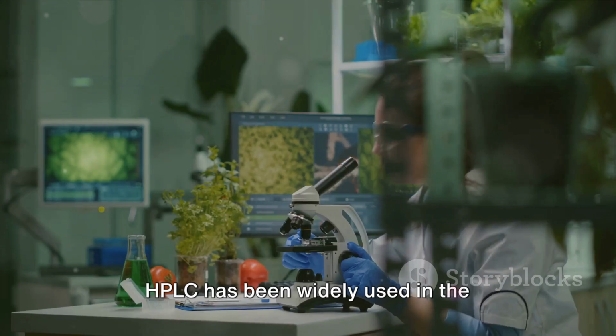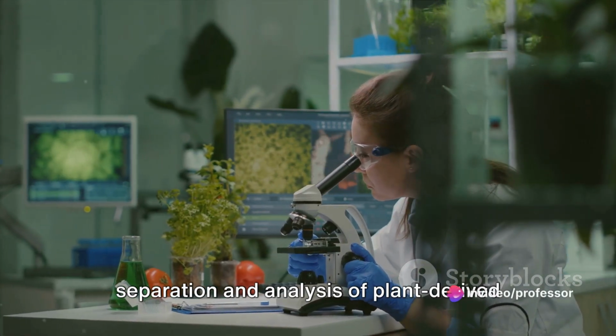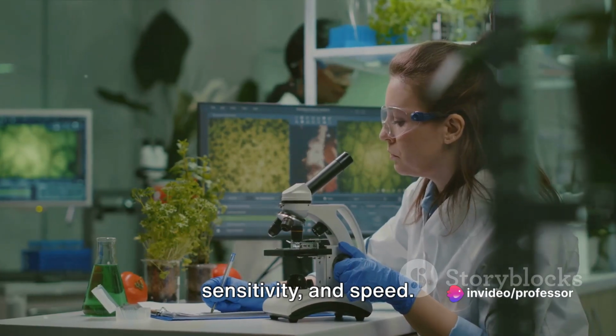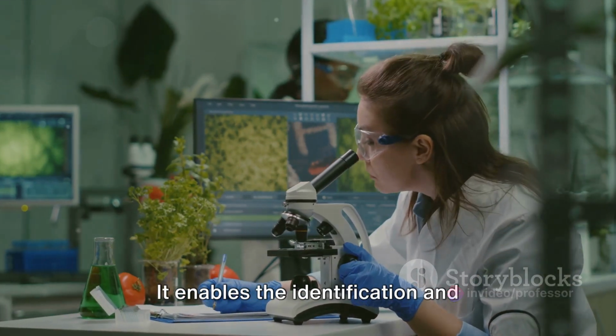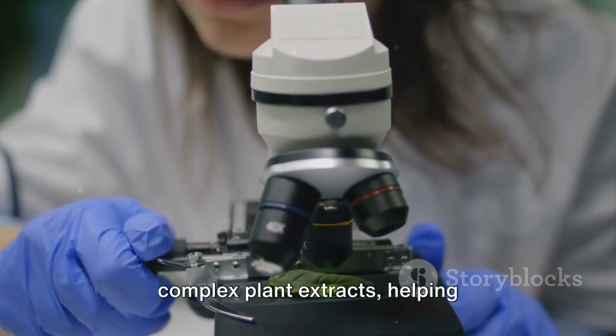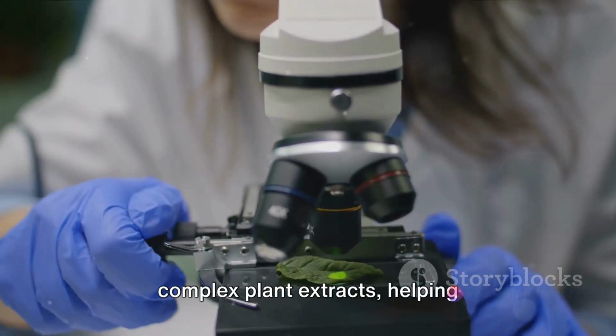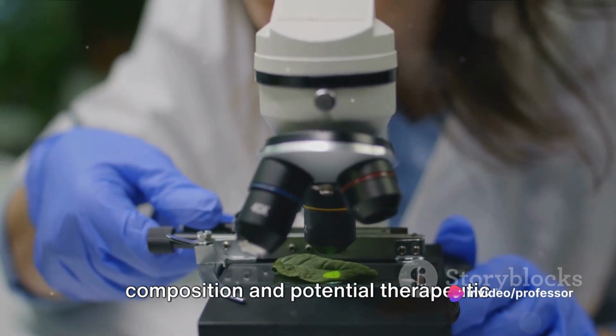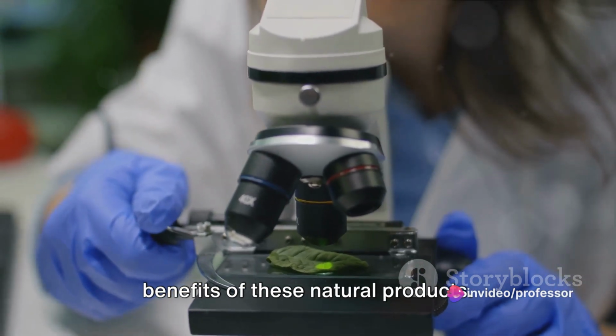HPLC has been widely used in the separation and analysis of plant-derived compounds due to its high resolution, sensitivity, and speed. It enables the identification and quantification of individual compounds in complex plant extracts, helping researchers to understand the chemical composition and potential therapeutic benefits of these natural products.